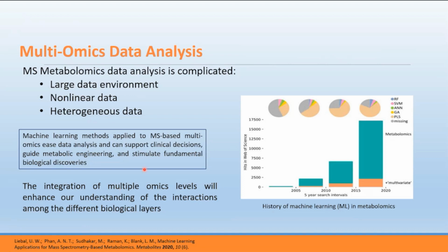And we've seen, with this data being really just up until 2020, a huge growth in the application of machine learning in metabolomics. And if we had 21 and 22 data for this, I would assume that this also follows that same exponential growth, mainly because there are a lot of tools now available to conduct artificial intelligence, and of course, a lot of interest in building these kinds of tools, especially with ChatGPT and those kinds of artificial intelligence approaches that have been made more commonplace.